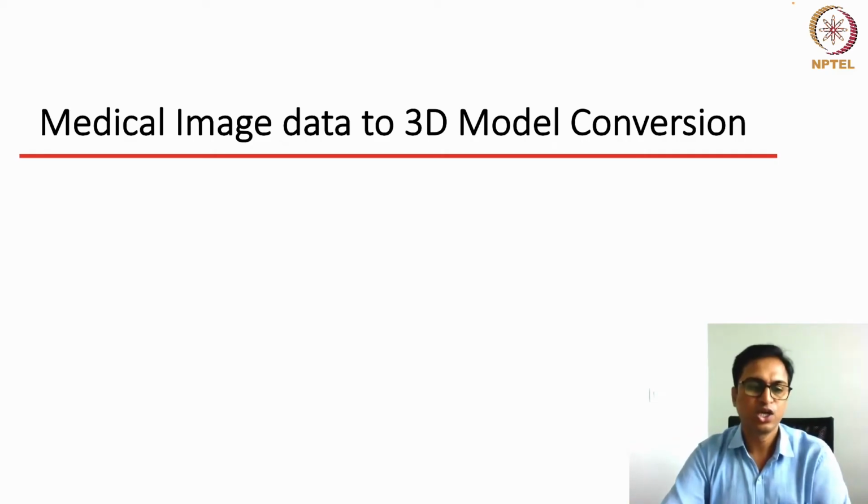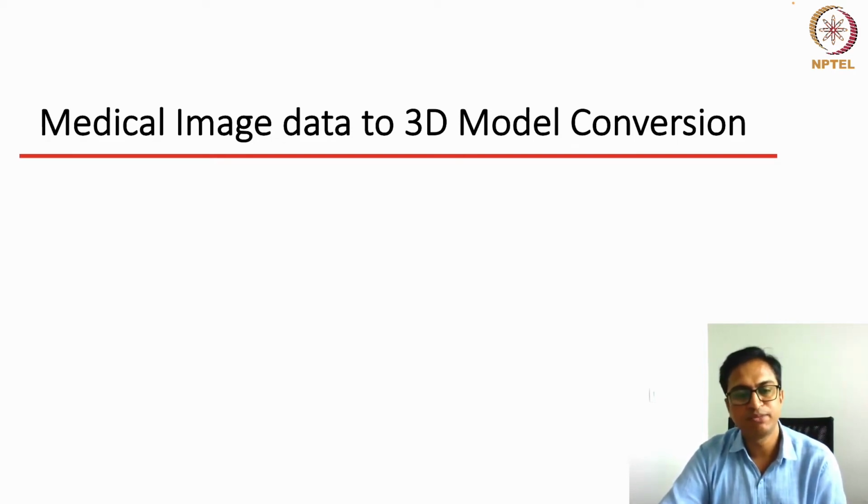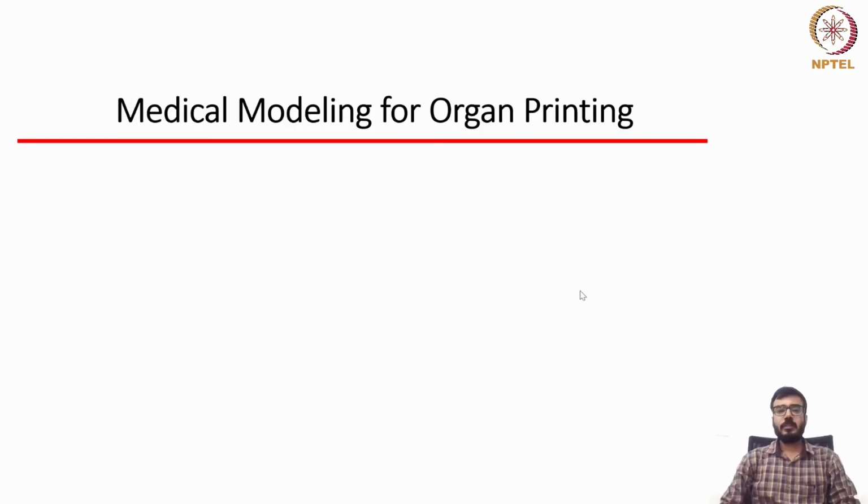So in this lecture, we'll discuss all these things: how this medical image data can be converted to a 3D model, and then that can be used for bioprinting applications. Now my student Bijay Shankar will show you what the process is, like how this medical image data can be converted with the help of a particular software.